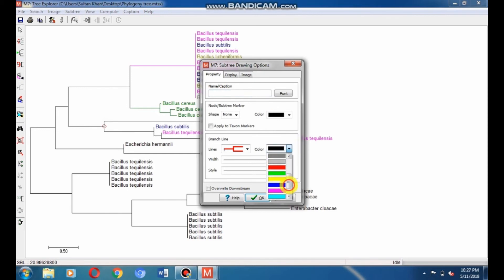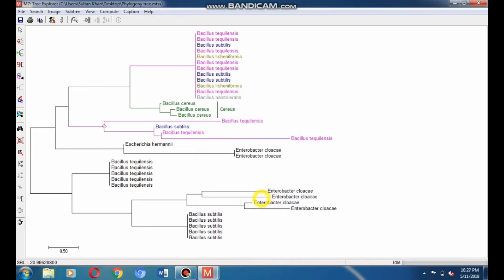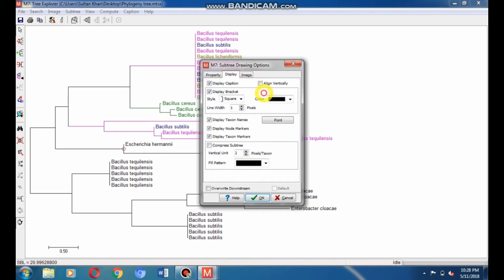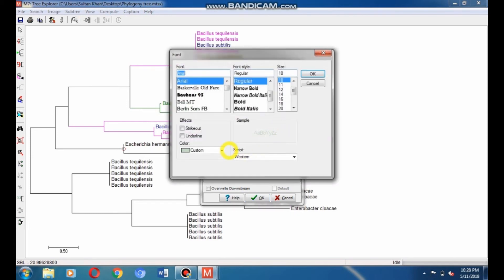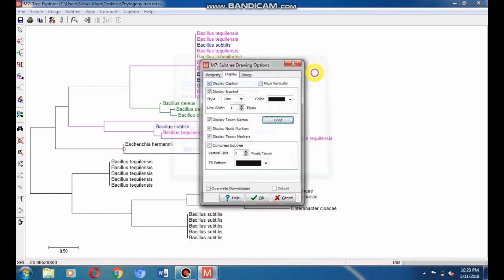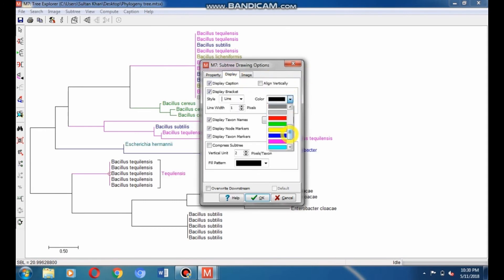Now give color to the Nitrobacter clade. Select the Nitrobacter clade node by putting the cursor in front of it. Go to subtree drawing option, click on Display, go to branch, select the branch style such as straight line, then choose Font and give it blue color. Go to Caption and type a caption such as 'Nitrobacter'. Go to Font and give it blue. By applying these simple procedures, you can give color to all remaining clades.